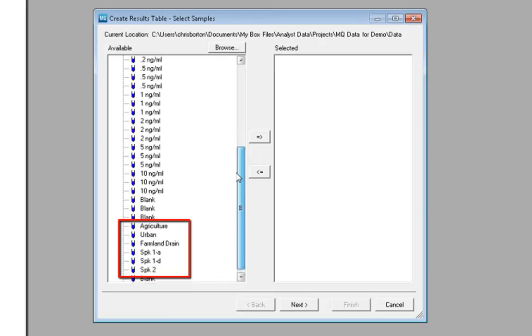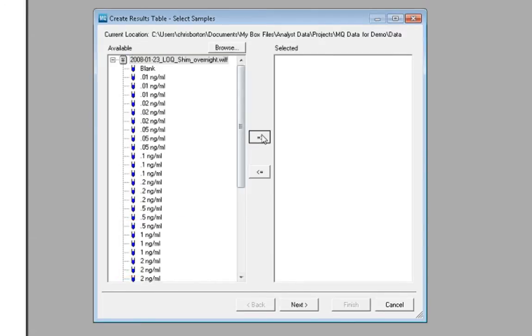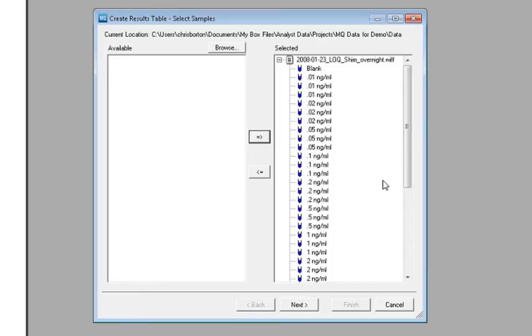We also ran a few quality control spike samples within this batch. We can add all of these samples to our results table by clicking the batch name, then the right arrow to add them to our table.